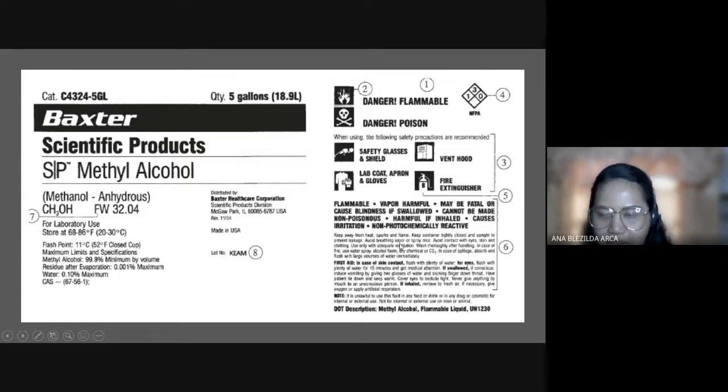And then kung makikita mo rin, meron ding class steps dito, di ba? Kung paano mag-first aid just in case merong injury being caused by this chemical. Okay? So, this is an example of a very responsible, very ideal label of a chemical in the laboratory.